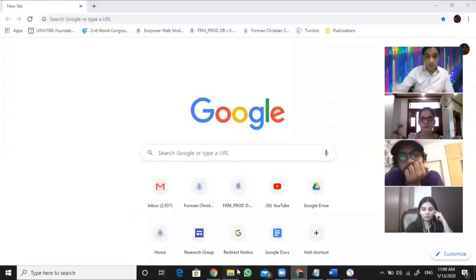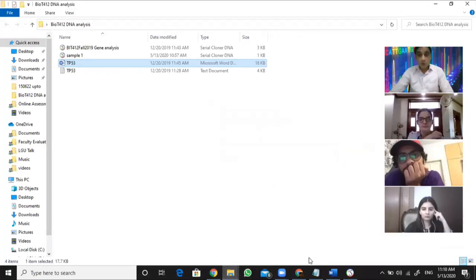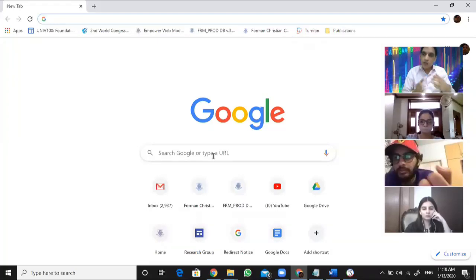So first we should know from where we can get the sequence of a nucleotide, and after that I will teach you how we can keep those sequences of nucleotides, how we can add customized information on the sequence we are generating. Okay, so I will be slow, but the lecture is recorded, so you can always come back to see the websites and the tricks which I will be doing in the meanwhile.